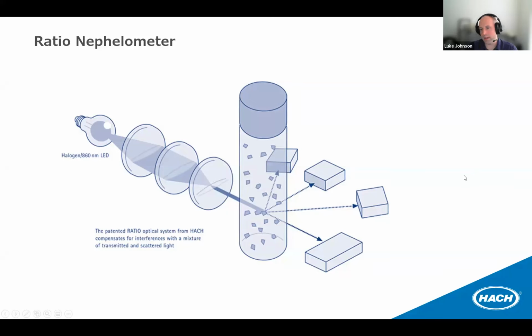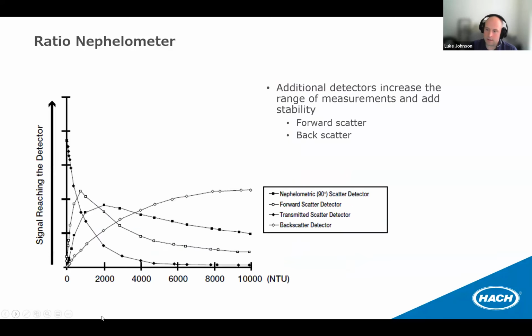And all of those are measuring the amount of light reflected at various angles off of each particle, and then correlating those to the light that is coming off the 90-degree detection, and correcting for color or size or amount of particles. And that's important because depending on the relative turbidity, more or less light will be scattered in the various directions.